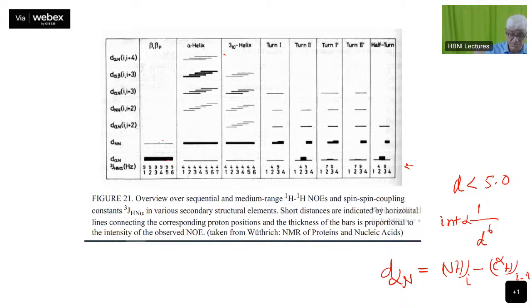That is why in a stretch of 7 amino acid residues, you will see from 3 to 7, 2 to 6, and 1 to 5. Right? So I plus 4. If I is 1, then this is 5. So you will see those ones there.